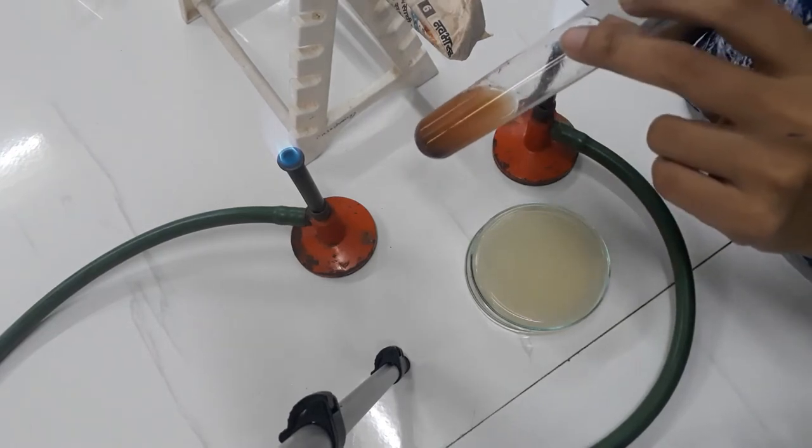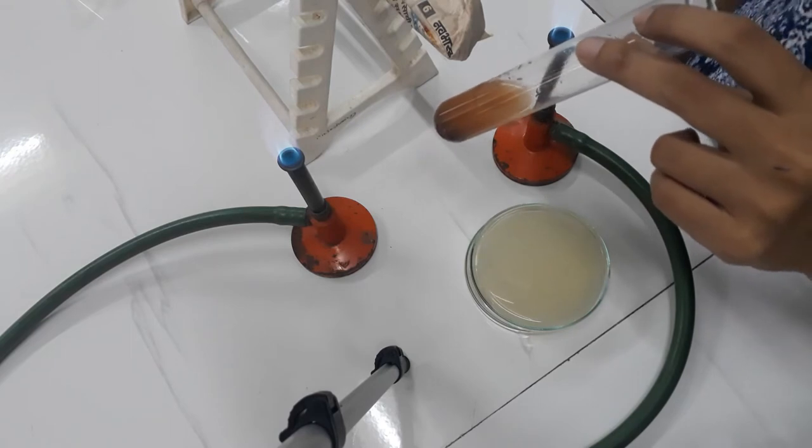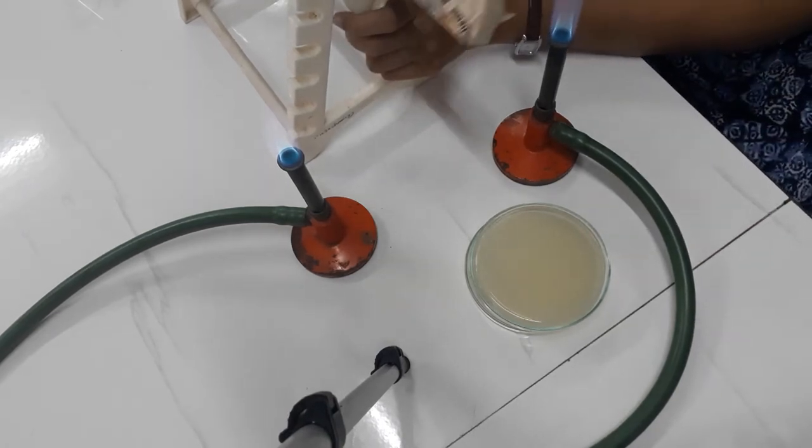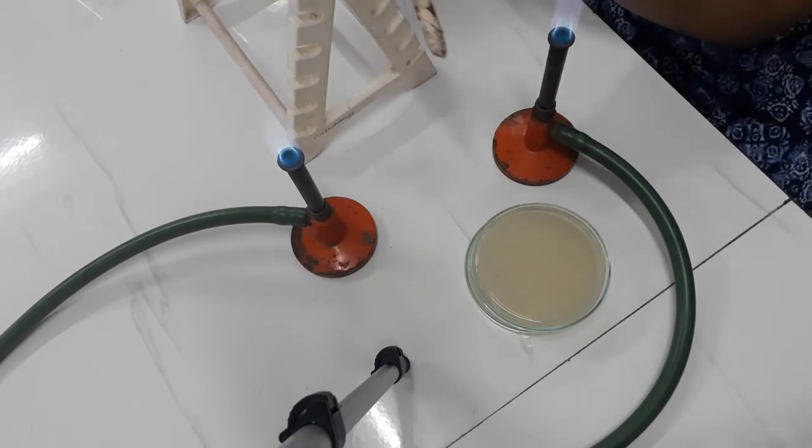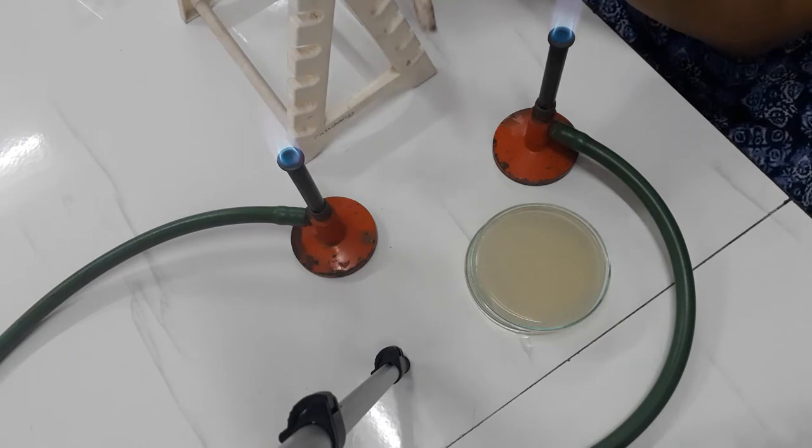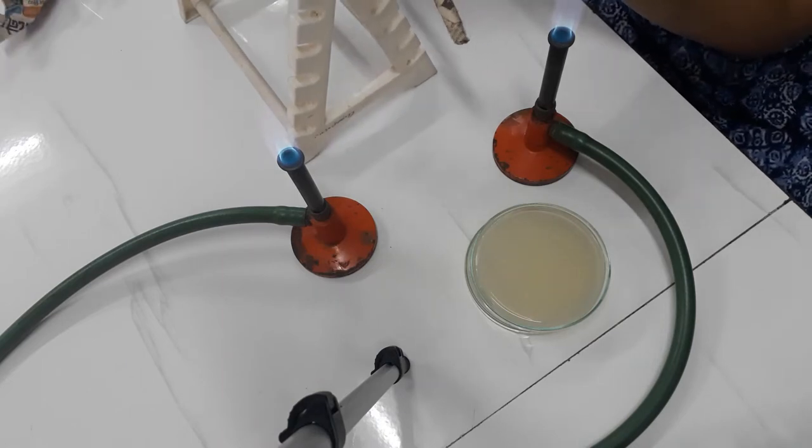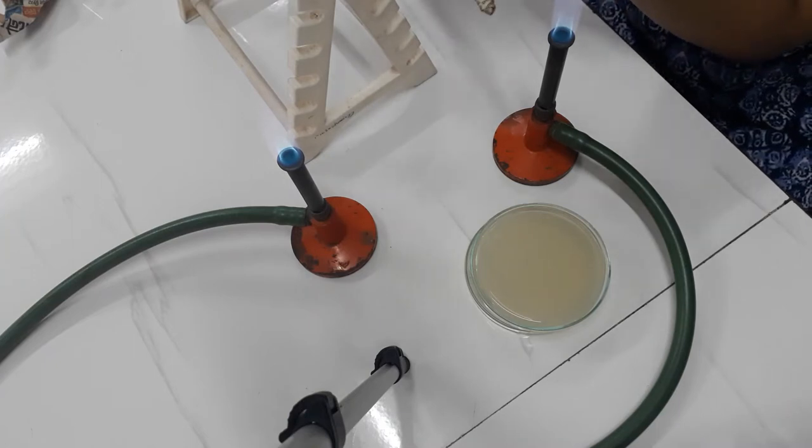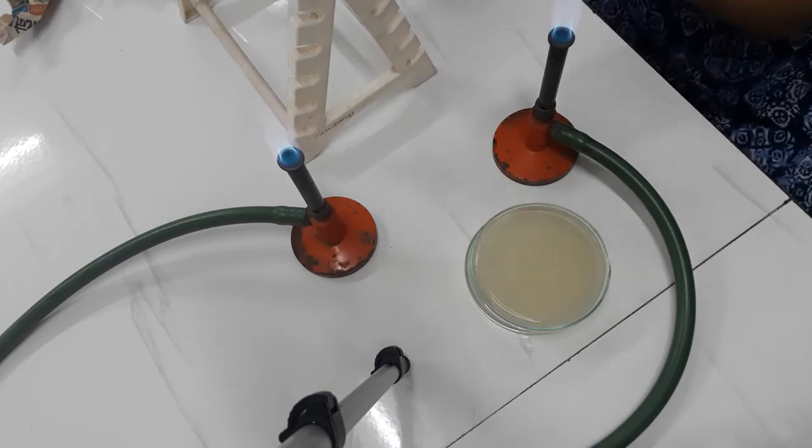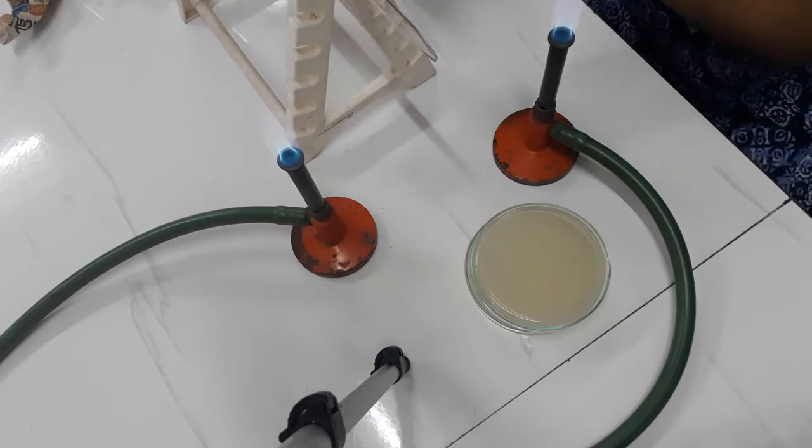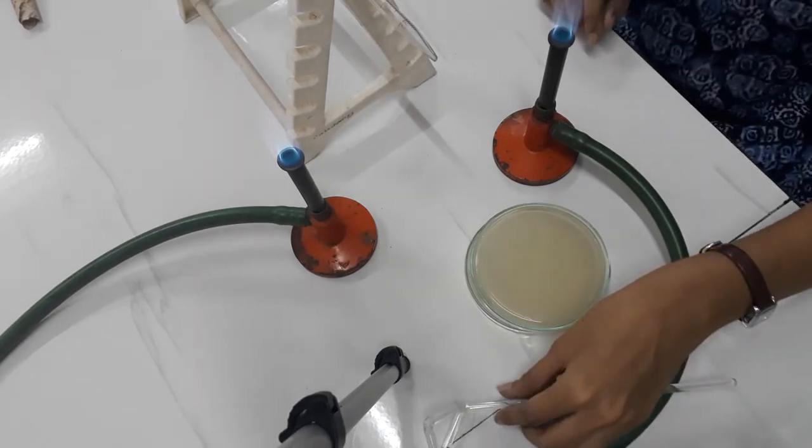Now the next step is doing a spread plate using 1 ml of the sample. So now we will be doing the spread plate technique where the first step is taking out the sterile pipette. We will open this in between the burners so the sterility of the pipette will be maintained. And the pipette tip has to be kept within the burners.